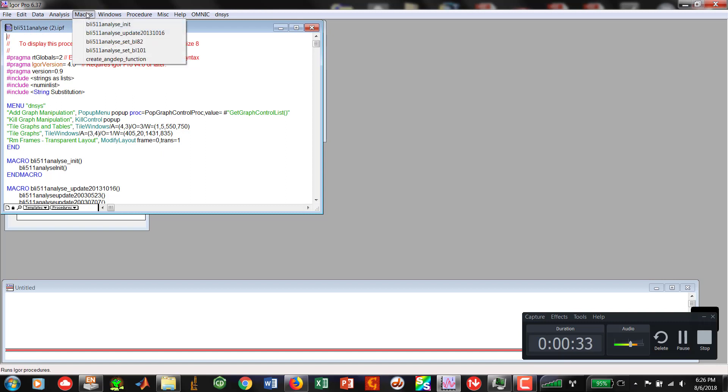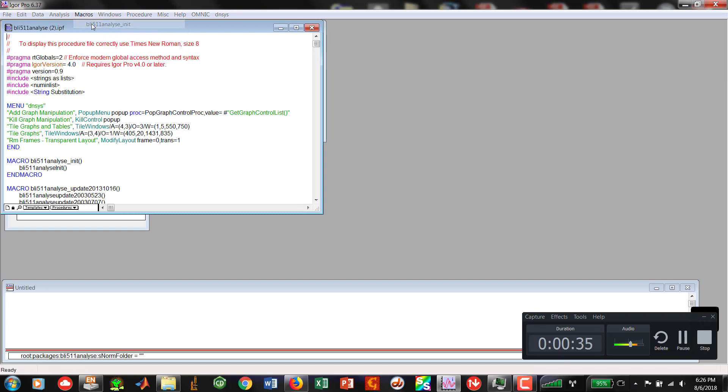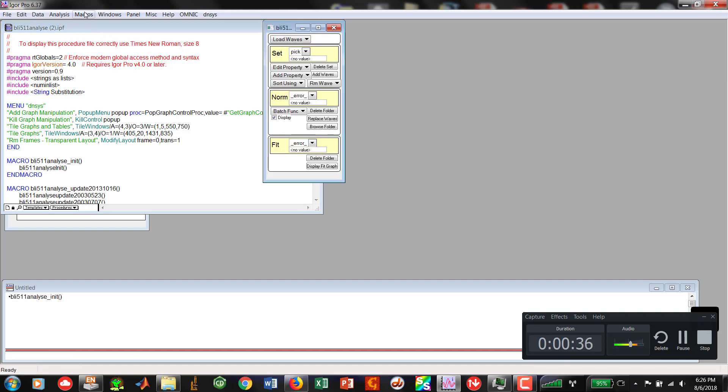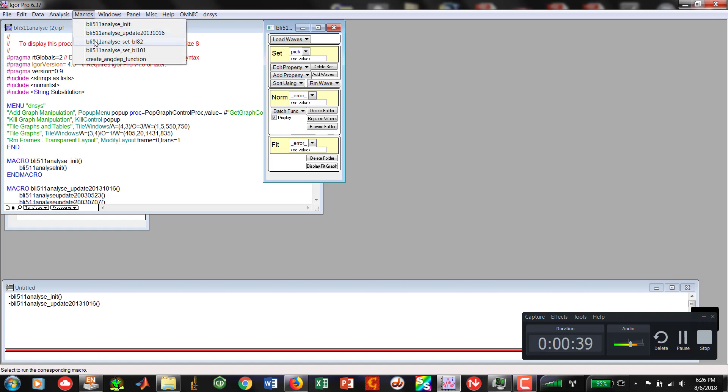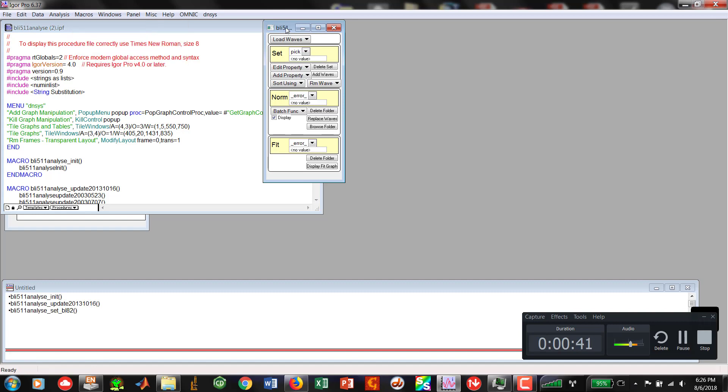I'm going to go into the macros, initiate, update, and then set BL82.